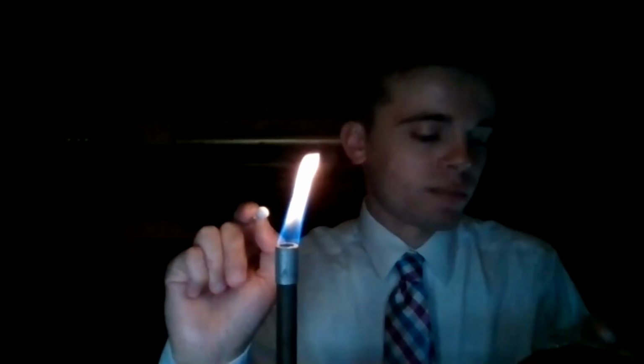So this one is like a yellow. I know on the camera it looks almost the same as strontium, but from where I'm seeing it, it's a nice yellow color. Is this barium? Yes, this is barium.